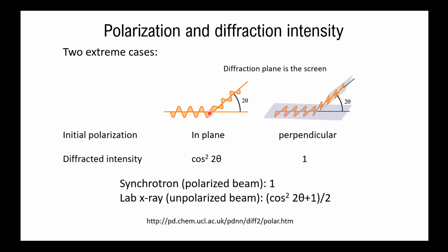You can imagine we have an atom here or an electron here that is diffracting this X-ray. Now we're causing this X-ray to be diffracted in this direction, right? So we'll have this kind of plane. And in our specific case, it is the slides or the screen we're looking at, right? So the screen is a plane, and the screen is the diffraction plane.